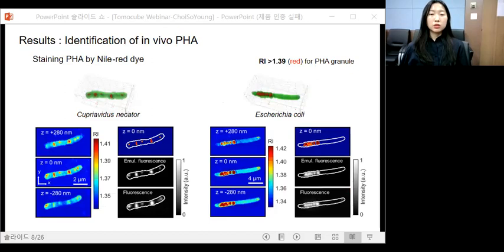First, we performed the identification of the individual PHA granules by the ODT systems. When the cells accumulating PHA granules were subjected to the ODT analysis, we obtained the reconstructed three-dimensional distributions of both cells, and also observed the distinctly high refractive index regions inside each cell, presumably PHA granules.